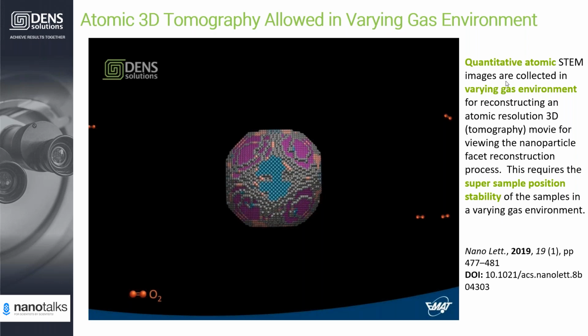If it changes, of course, you need to control the electron beam dose or dose rate to a level that doesn't modify your reaction. Of course, there are also questions coming about, initially my reaction is inside a microreactor. Could the confined space in your nanoreactor trigger the reaction?